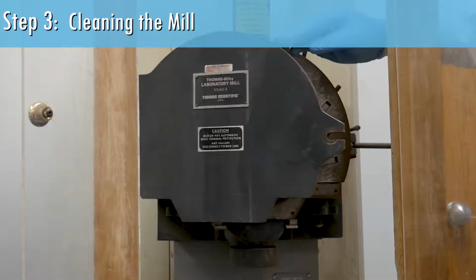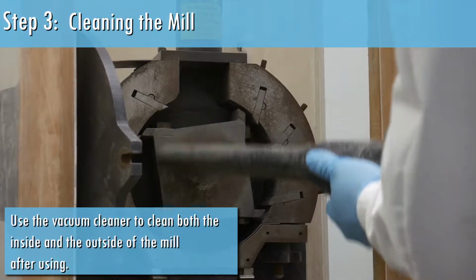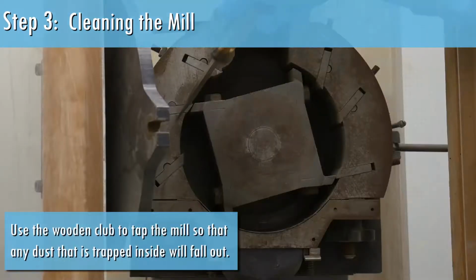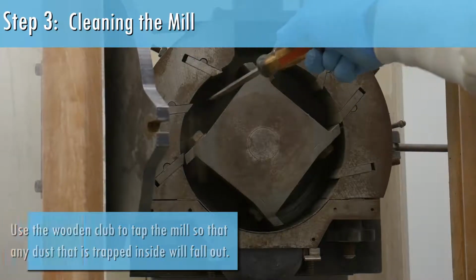Next is the mill. Use the vacuum cleaner to clean both the inside and the outside of the mill after using. Use the wooden club to tap the mill so that any dust that is trapped inside will fall out.